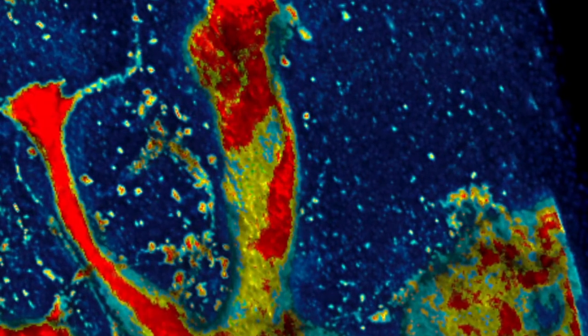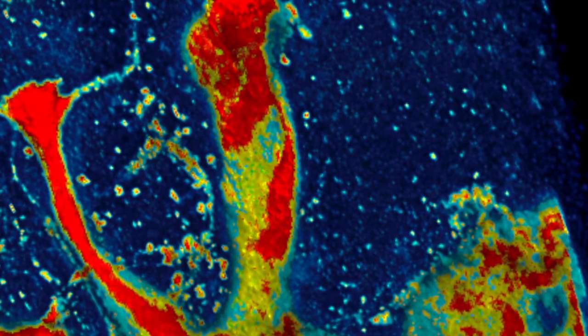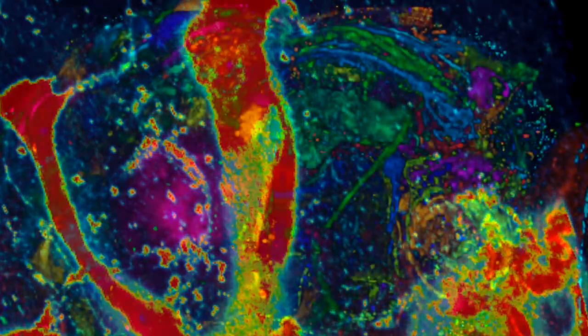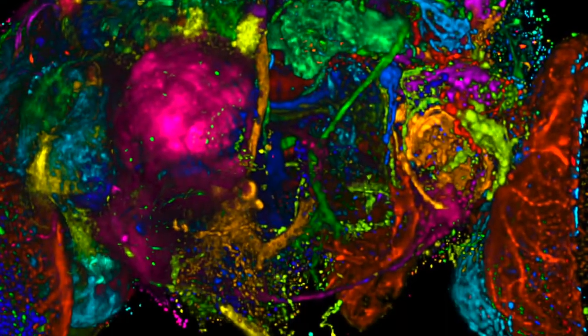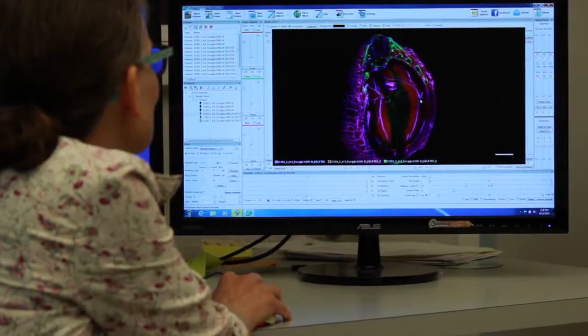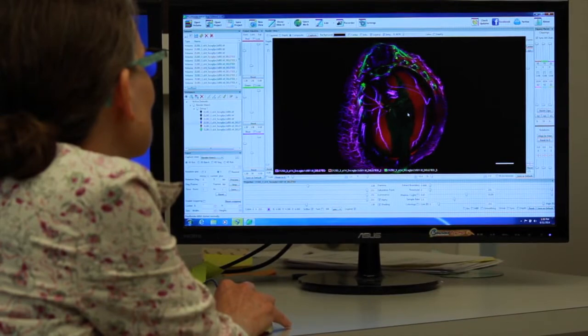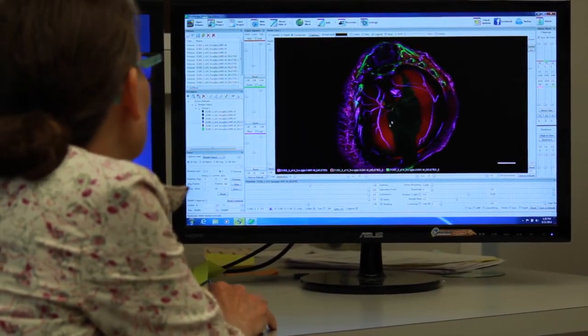So Gabrielle Cardin here at the University of Utah is studying genetic abnormalities in mice and using confocal data to image mice embryos both in vivo and ex vivo, and has found that FluoRender is a valuable tool for her research in the Cardin lab. And so it's nice to see FluoRender go beyond just zebrafish to other biology usages.